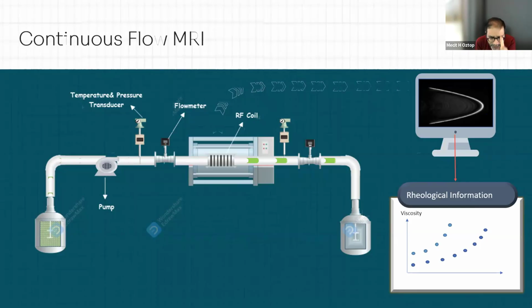This system that we utilize is a pure device MRI system. It is a 0.5 Tesla MRI system that has a special design to integrate this flow apparatus. Like both ends are open. I'm going to show the system also later on.